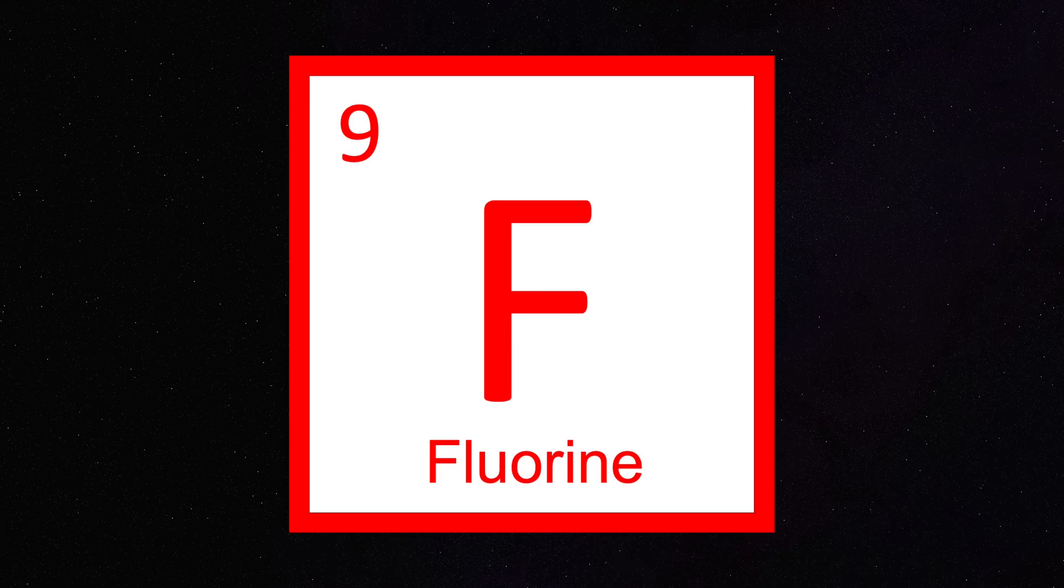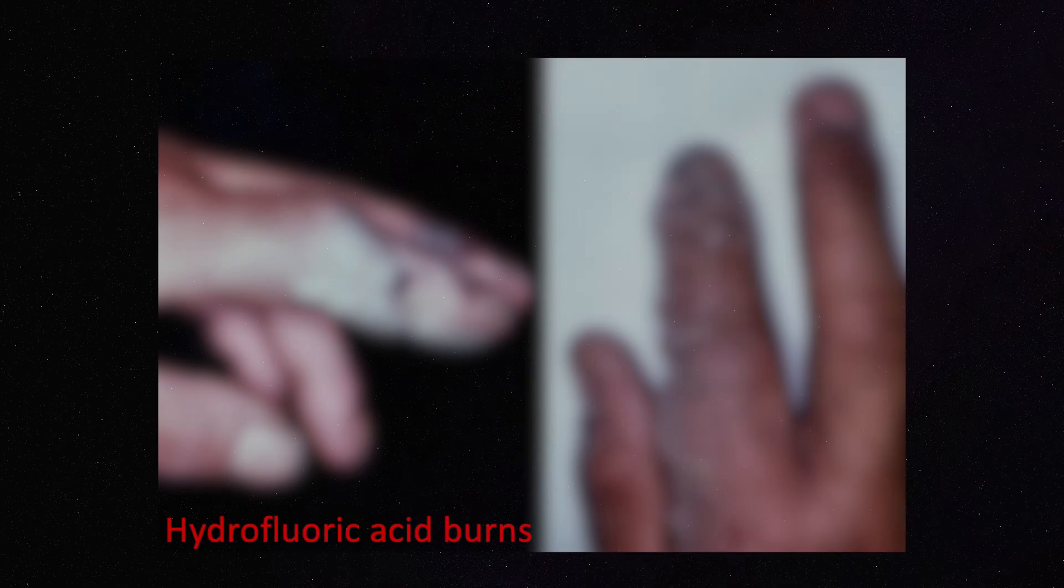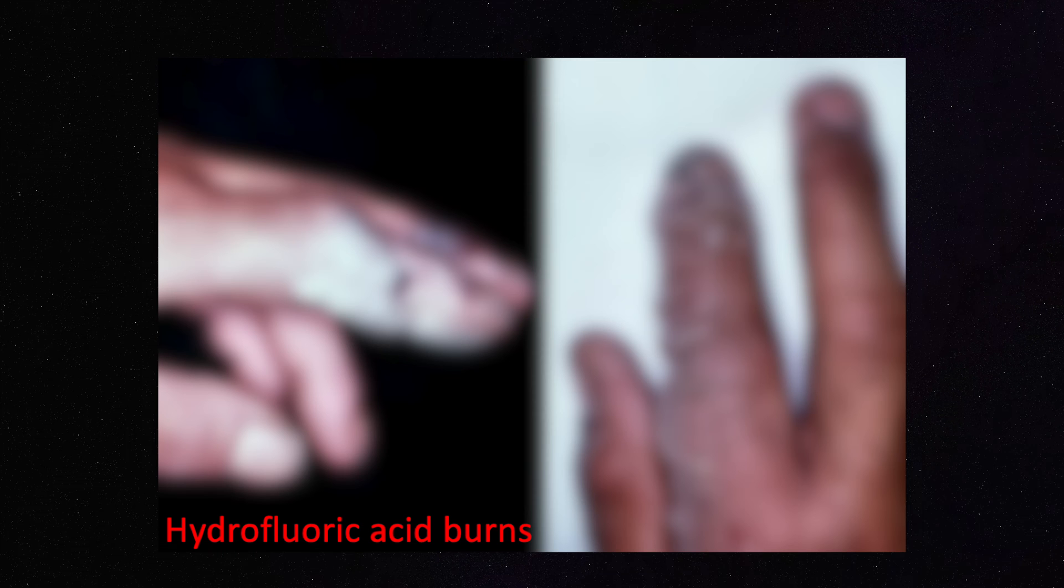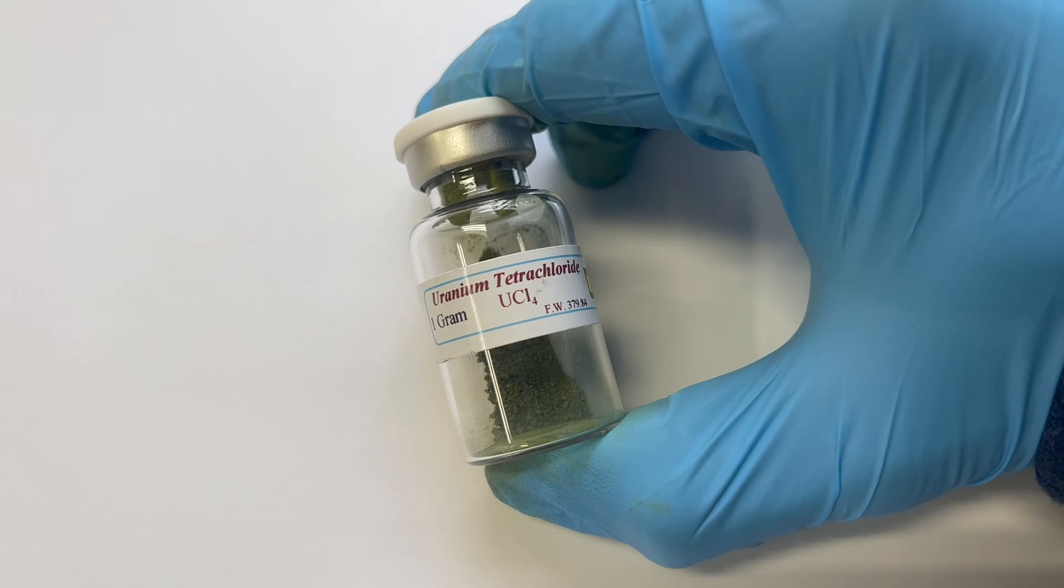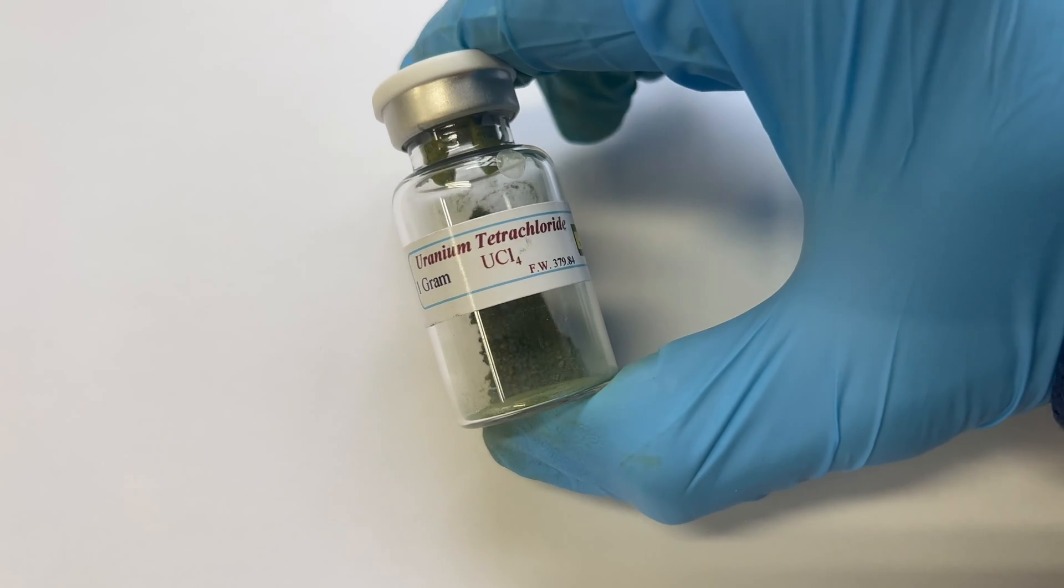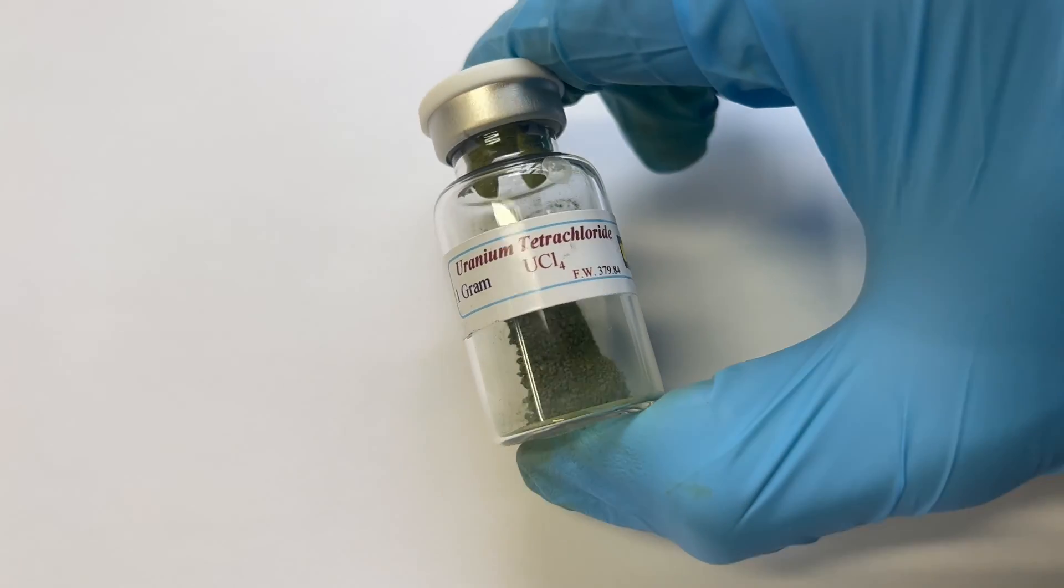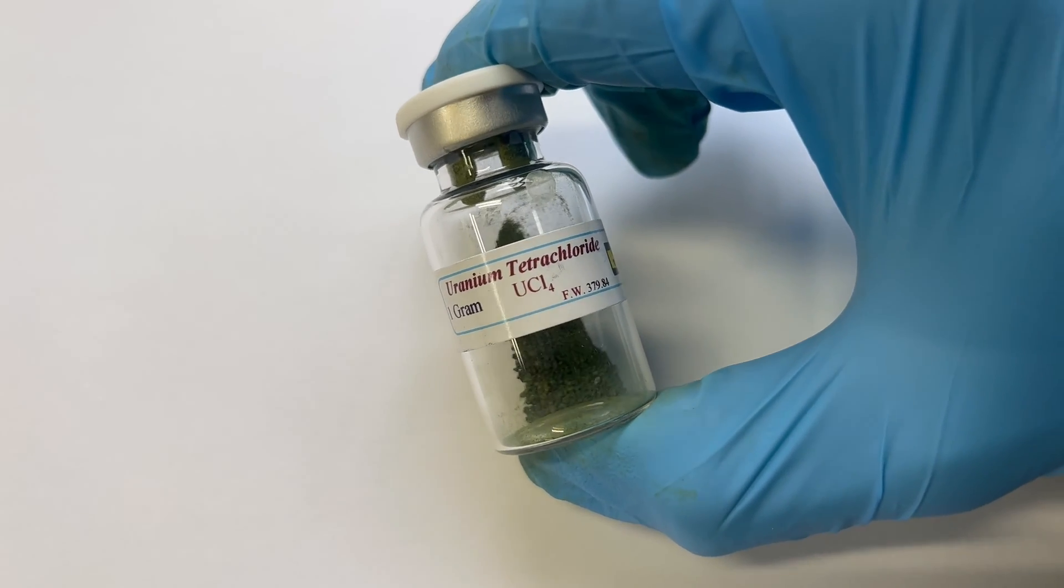Most of the time that's fluorine, but fluorine is quite annoying to work with. Another great option is chlorine, which is where uranium tetrachloride steps in. It's a gorgeous green solid that serves many uses, such as the reduction to uranium metal.